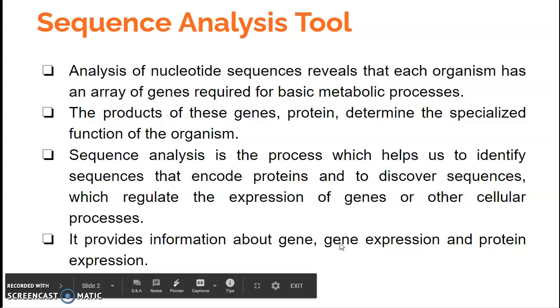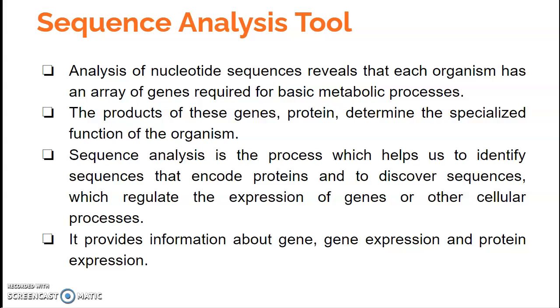So, sequence analysis tools. Before we move on with the different sequence analysis tools, it should be very clear what we are using them for. Because we know that all life in the world exists based on the beautiful arrangement of the nucleotides, followed by the beautiful arrangement of amino acid sequences in the protein, and how they are expressed determines how the characters are formed. So to understand this, sequence analysis is very important.